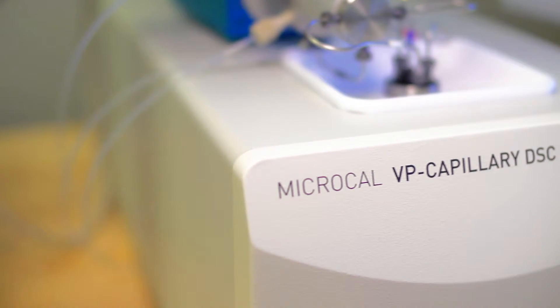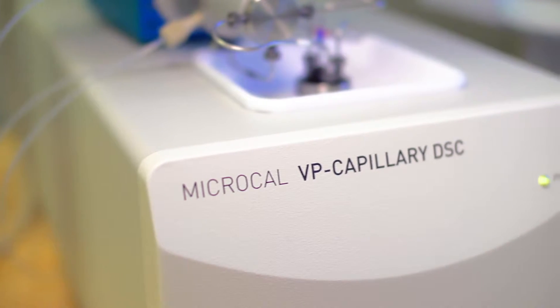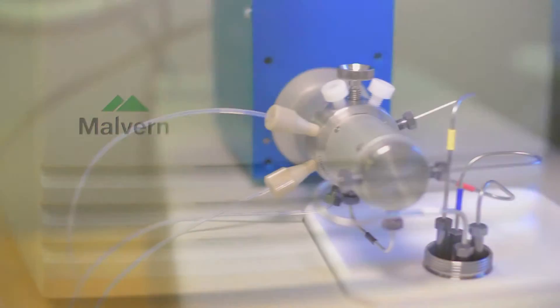The MicroCal VP Capillary DSC range is a highly sensitive, easy to use differential scanning calorimeter for the study of samples in solution.